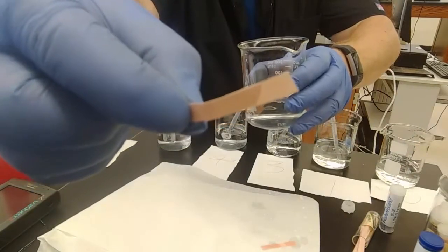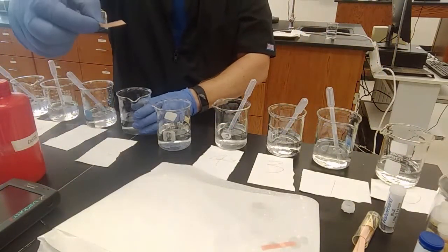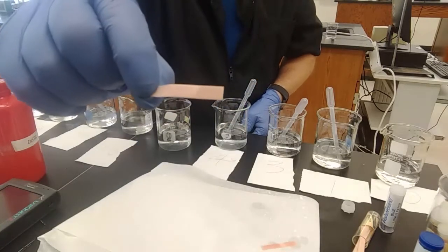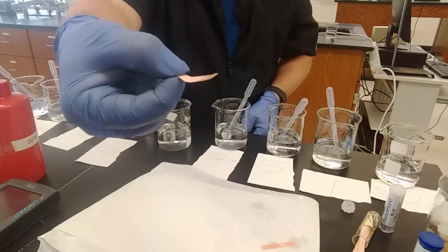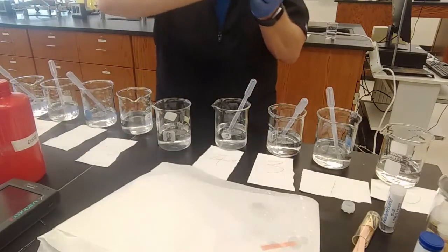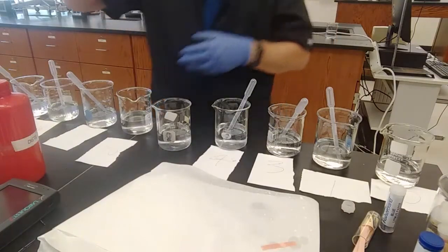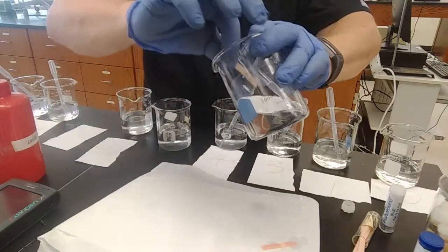But it doesn't. This seems to be confirming our pH meter that we don't have pH 10. We expected pH 10 based on our dilution, but our water that we were diluting with seems to have been contaminated. Expecting pH 11 should turn blue.